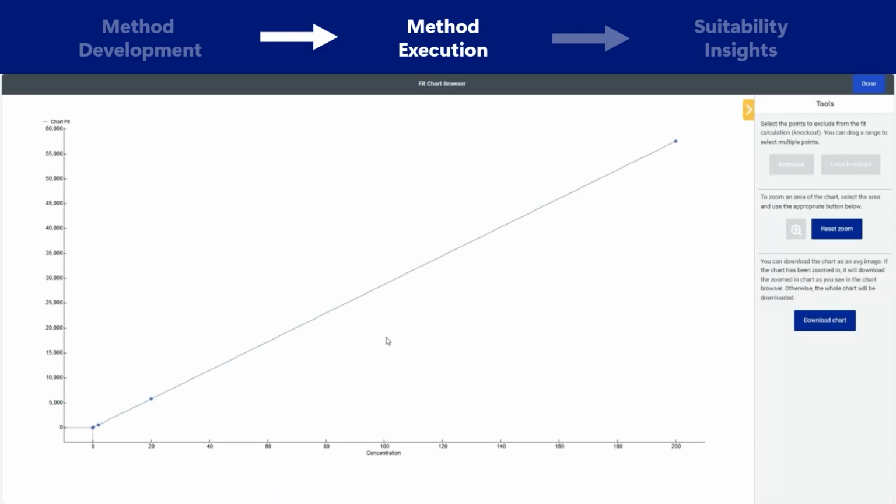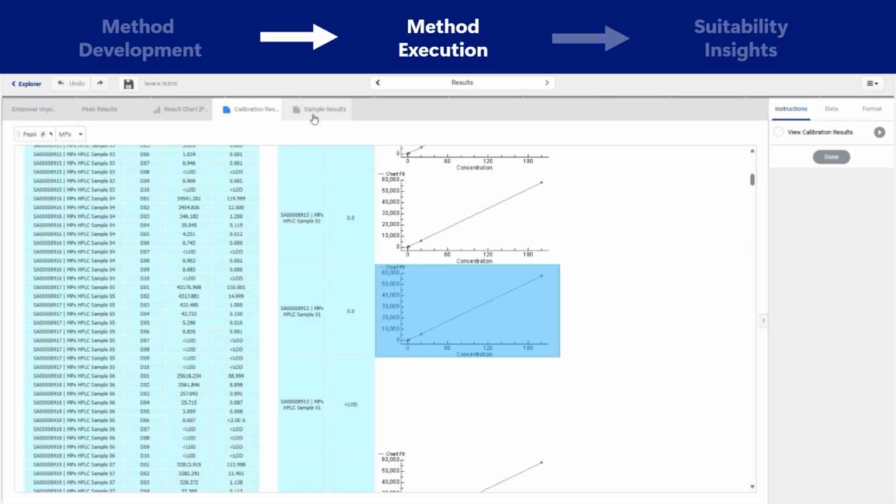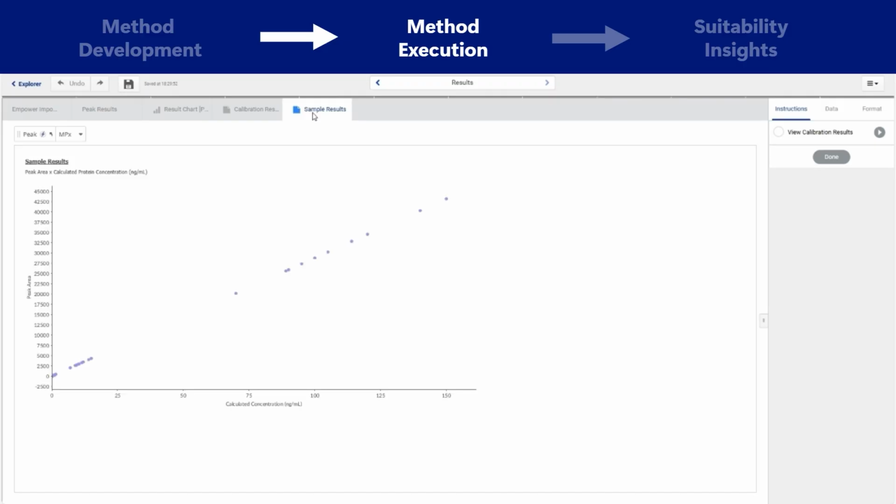Now, within each of these curve fits, I can open them up and I can knock out data points, which will modify the underlying calculation that's retrieving some of the parameters from those curves. Because, of course, from those curves, I'll want to be able to calculate things like R squared, perhaps. So here you can see I can knock out data points, knock them back in again. I can highlight parts of the curve if I need to.